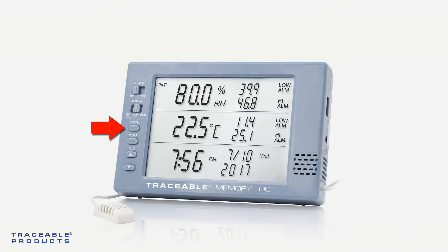Then press the set/select button to switch to the other display. Press clear once more to clear that alarm. If the parameters fall back into the normal range and then back out of the alarm range, a new alarm will be triggered.